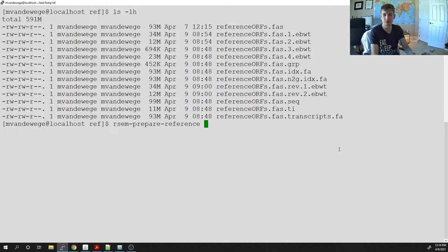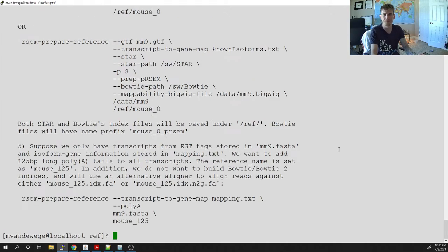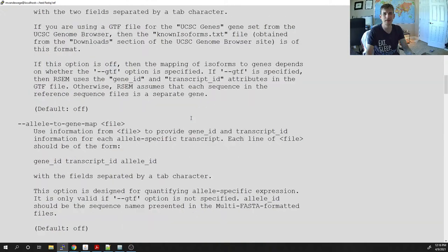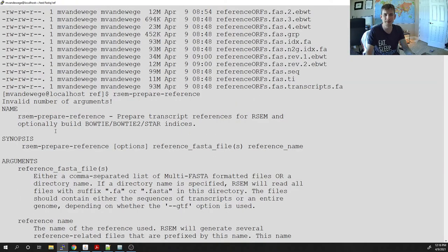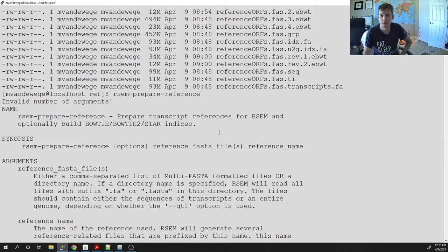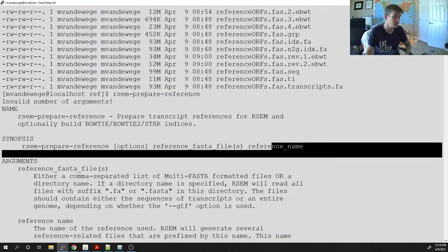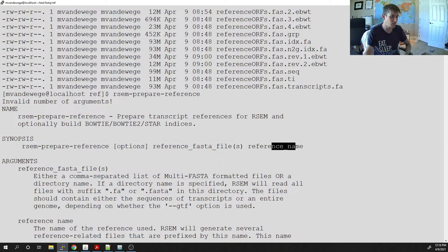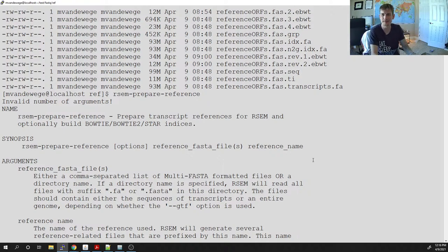By default, running rsem-prepare-reference without options shows all the options. The first line tells you how to actually run the program: you run rsem-prepare-reference, supply options, a reference fasta file, and then a reference name. I traditionally keep my reference fasta file and reference name the same — it seems a little better for downstream analyses.